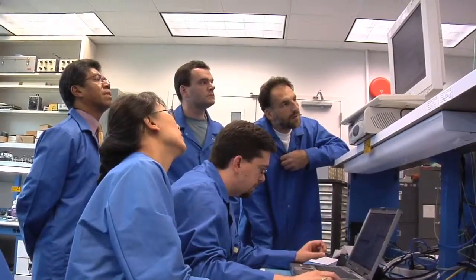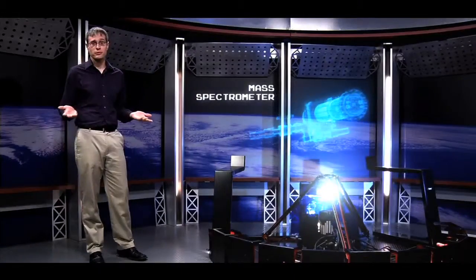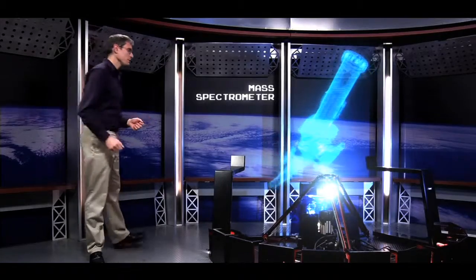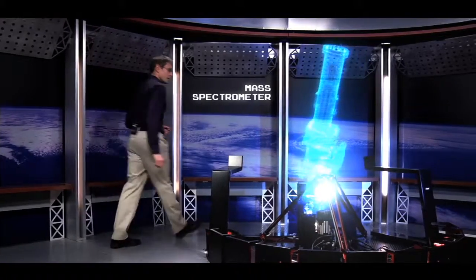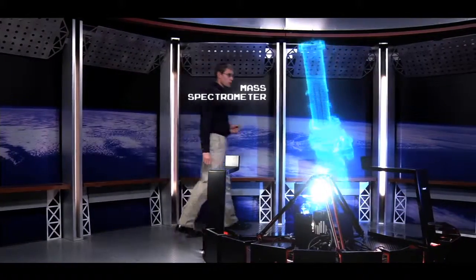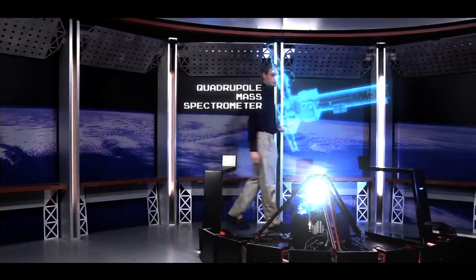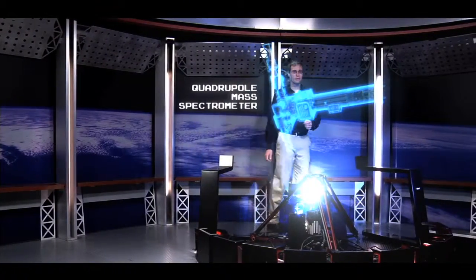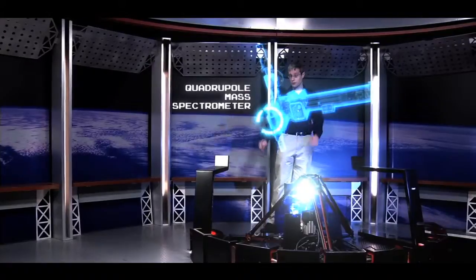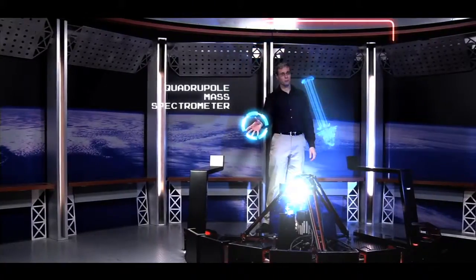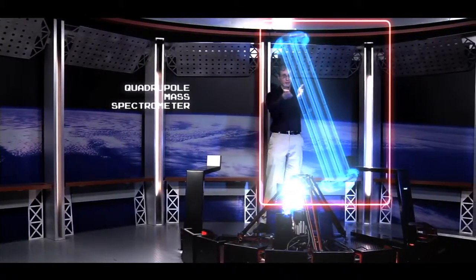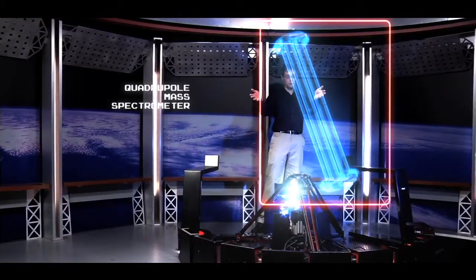But the important question is, how does it work? Today we'll be looking at a special kind of spectrometer called the quadrupole mass spectrometer. It's called this because of the four long poles that make up the center of the instrument.